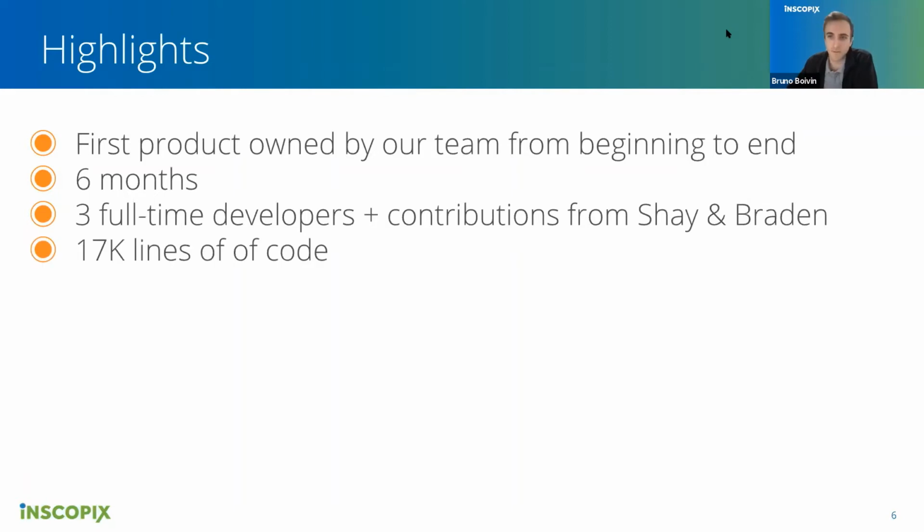In total, there's about 17,000 lines of code, and I realized that it might be hard to determine whether that's big or not. I didn't have a chance to compare that number of lines with the rest of the features in IDPS, but my guess is that it's probably just as big as all the other features in IDPS combined. So it's really a big module that we've added. And the reason for that is because CNMFE relies on many other algorithms to do different parts of it. And so that forced us to re-implement a lot of different algorithms that exist out there.